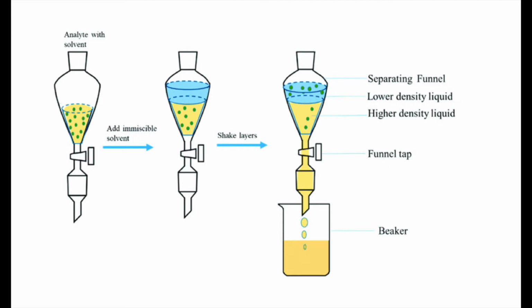The essential oil molecules that we are extracting are nonpolar. They are not going to want to be in the water layer, but rather in the dichloromethane layer. So we will be using dichloromethane to pull the nonpolar compounds out of the water layer into the dichloromethane. For clarification, the water layer is the aqueous layer and the dichloromethane is the organic layer.